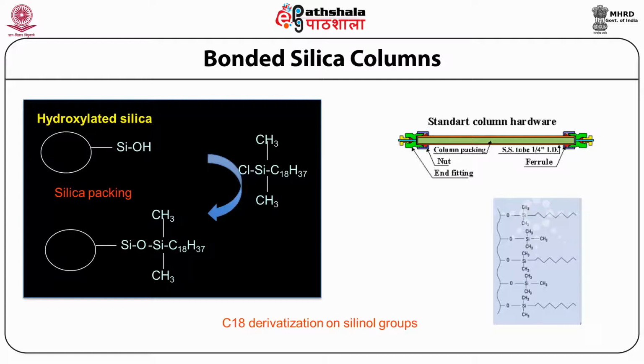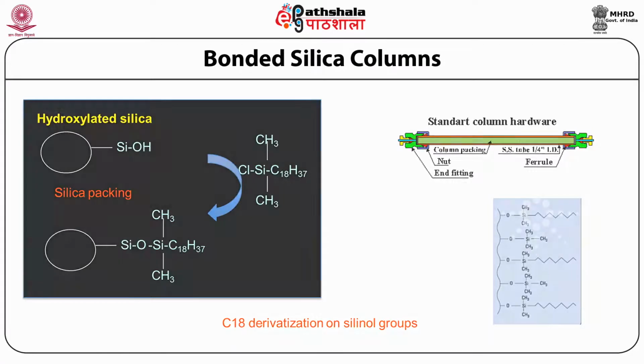This partition makes partition chromatography effective when you're using two solvents together, especially water and acetonitrile or water and methanol, etc. Sometimes we use directly only one solvent, that is methanol. When you use methanol, it behaves as an adsorption chromatography. When you use two solvents, it behaves like a partition chromatography. That is how the columns behave in the HPLC, which allows you to separate the compound.